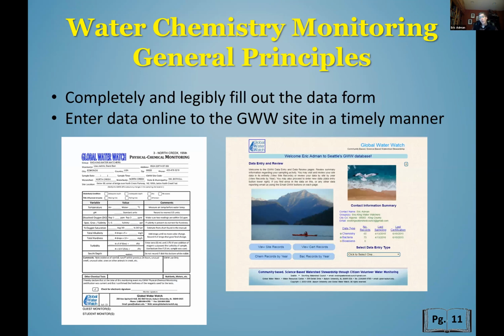A couple of other general principles are, when you record your data on the data sheet, try to make it readable in case you want to refer to it in the future or you're going to send it to somebody. And then try to enter it in a timely manner so that somebody can actually look at your data and something happens with it.